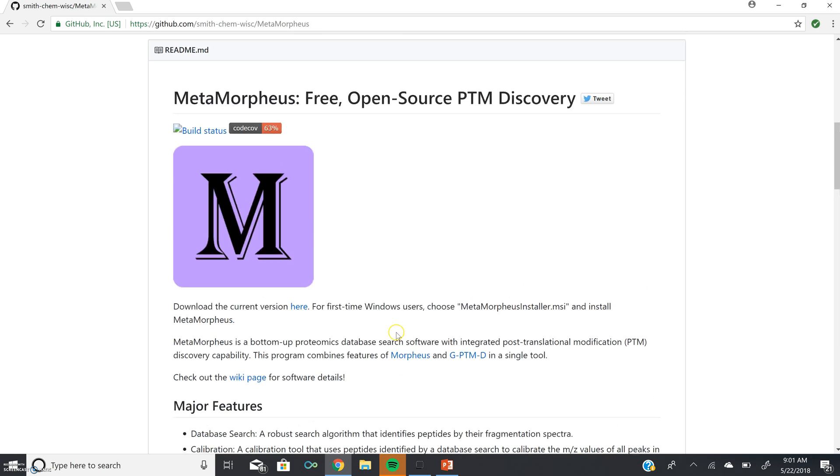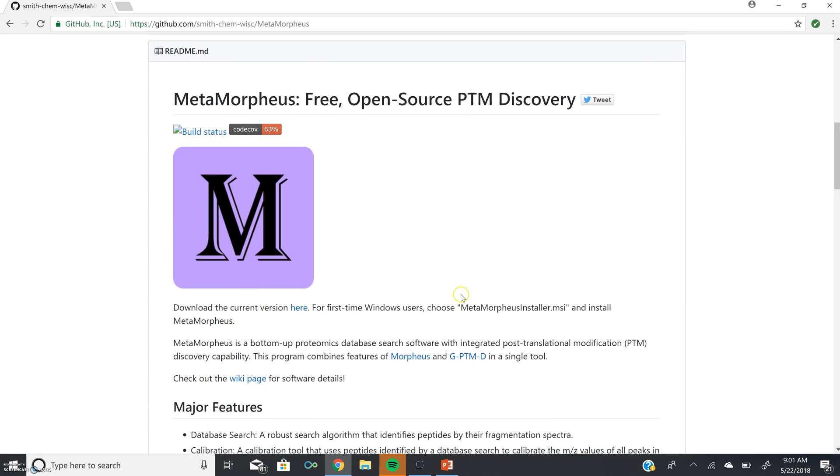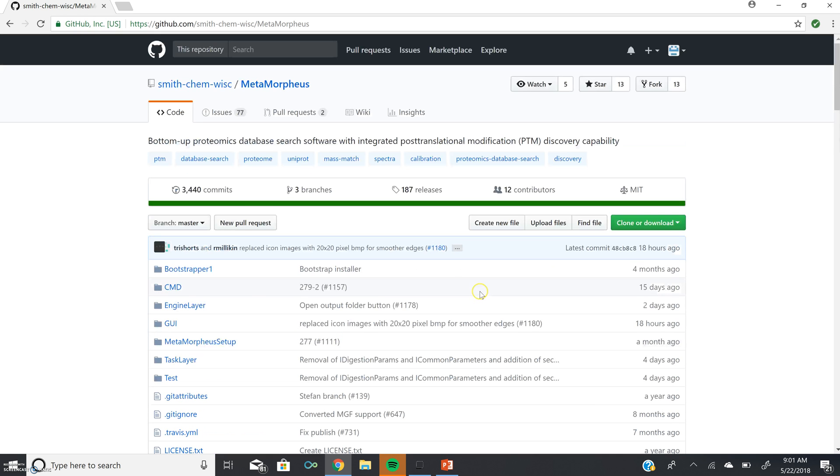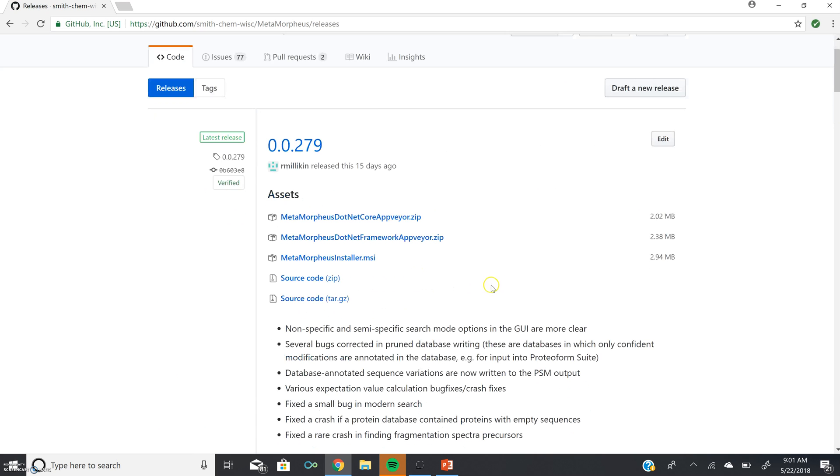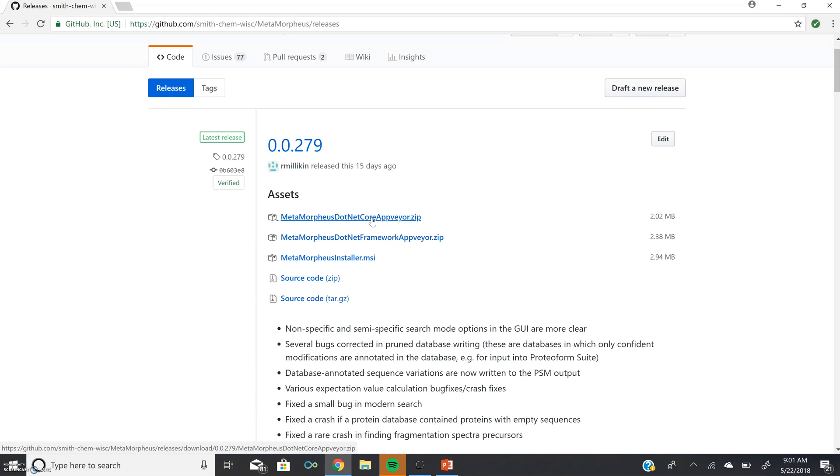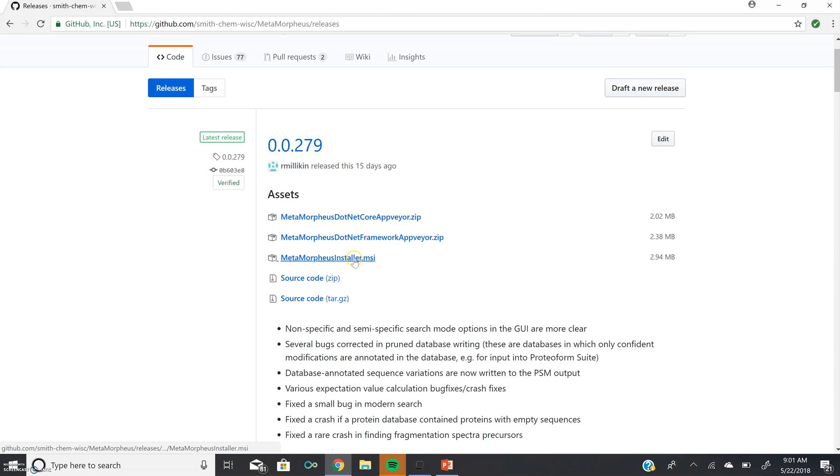You can do this here in the README where it says Download Current Version or at the top of the page, clicking where it says Releases. This will bring you to the latest release of Metamorpheus. You'll see here there are multiple things that you could click to download, the first of which is the program for Linux command line operation. For the Windows GUI, you want to click on Metamorpheus Installer.